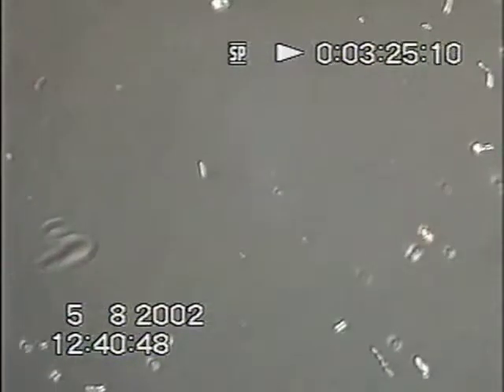He's obviously... to be very many like this. We've got this about as contrasty as we can, or can we do a little better? I don't think we can do any better.